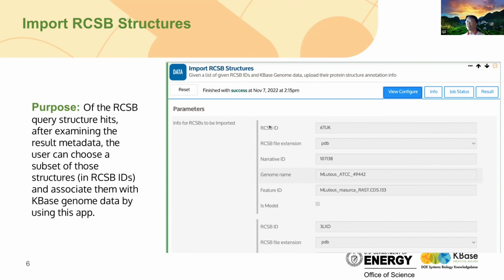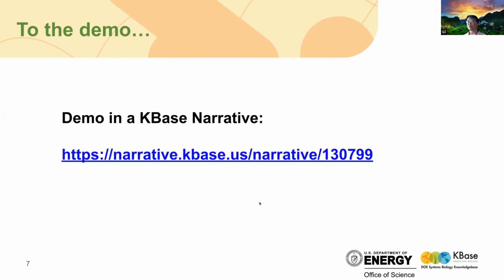For one individual input, you can have multiple. So this one will be the second one. You found your hit, this one first, the second, and so on and so forth, and then you can upload them. But you also have to specify a threshold for the upload.